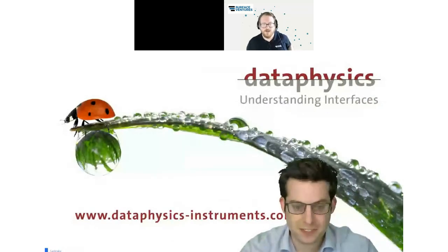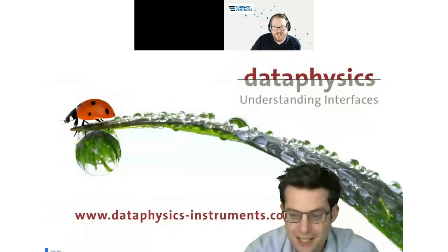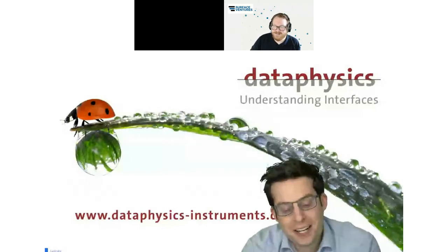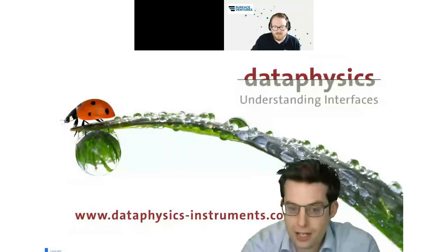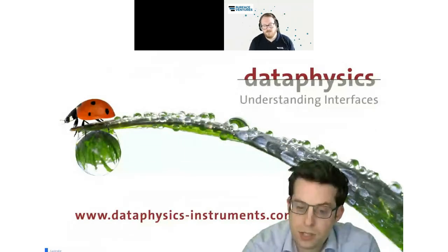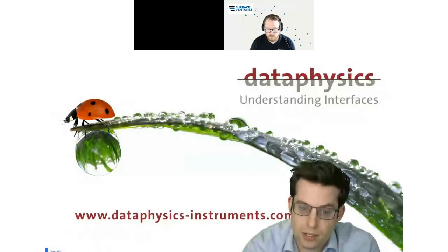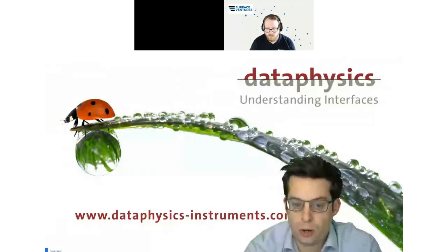Going on, regarding the imaginary contact angle: if I call this a pseudo contact angle, would it be misleading? It's interesting. What I can tell you is that some people, when I tell them we can measure imaginary contact angles, ask what this is. If I told them we are measuring pseudo contact angles, they would probably give me the same answer. I think this is a concept, and it is also named imaginary contact angles in the literature. I would stick with this term, because if we call it pseudo contact angle, we might confuse other people. They then don't know at all what they are talking about.